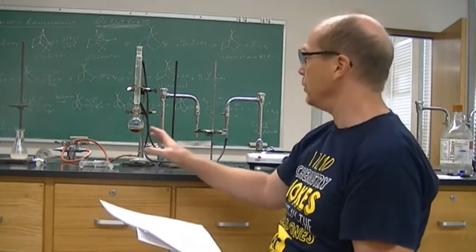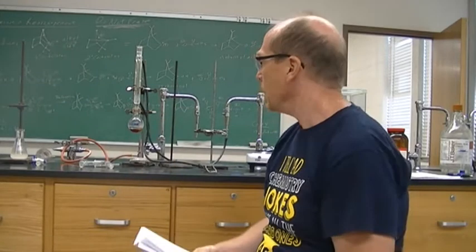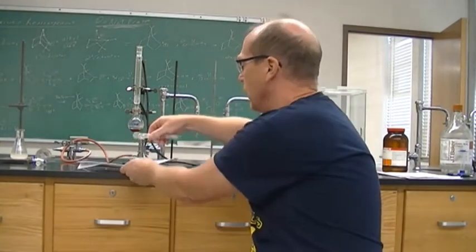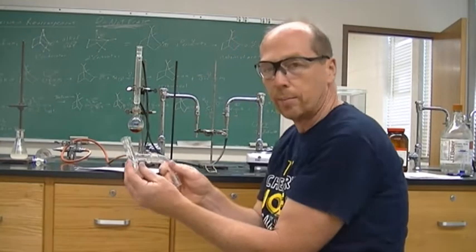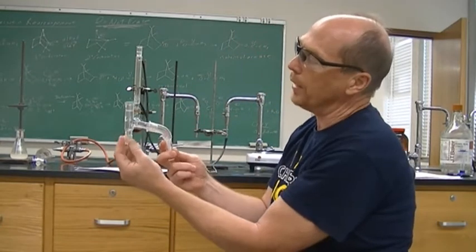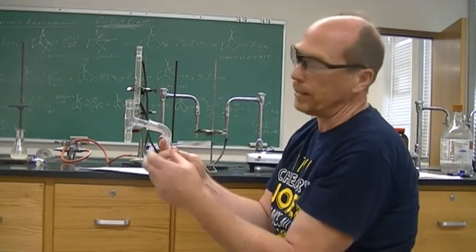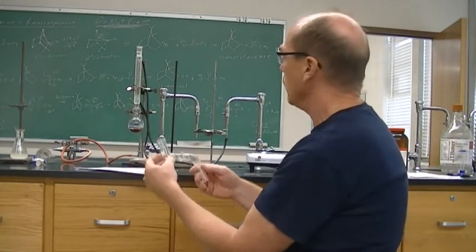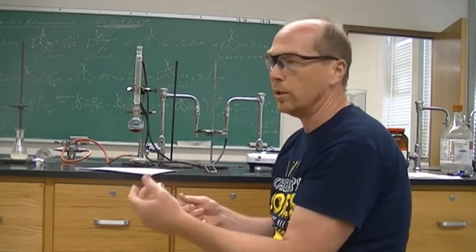Now in this distillation, your solid is going to be coming out because as it cools through the condenser, it turns into a solid, which tends to clog the condenser. And so what I'm going to do is skip the condenser and do an abbreviated condenser. It's going to be an air condenser. And I'm just going to boil it and then collect it so that it doesn't get clogged up on the way down. You can do it either way.